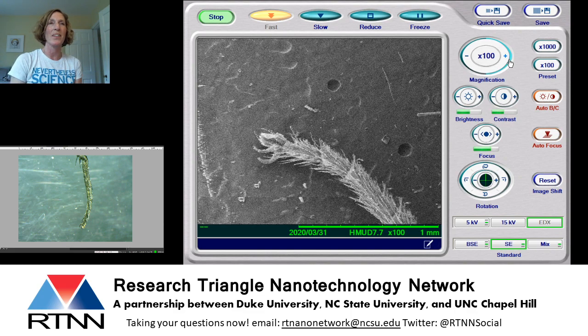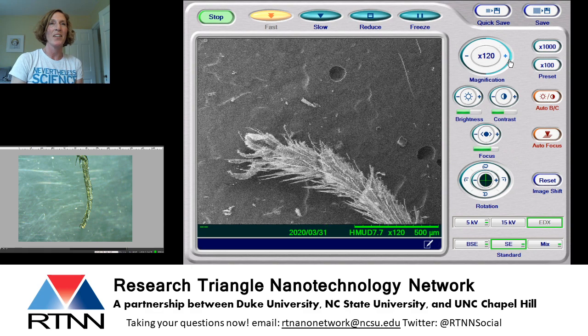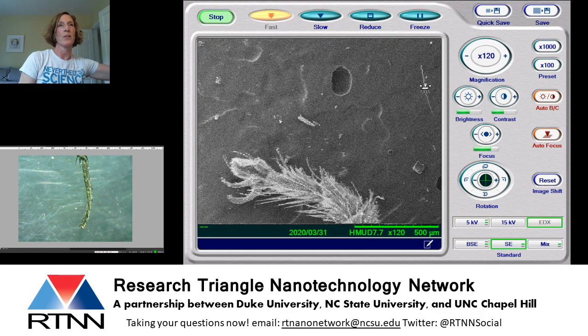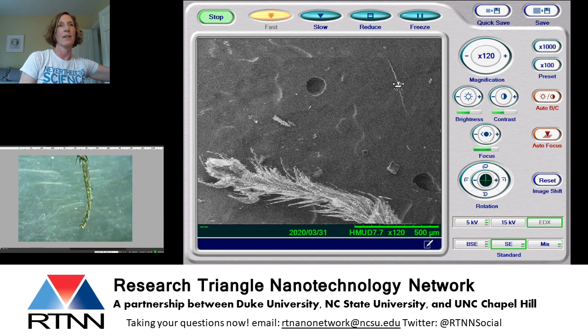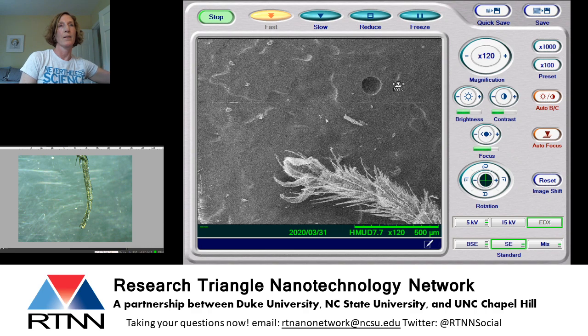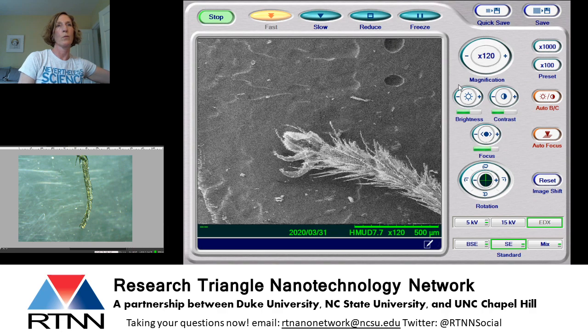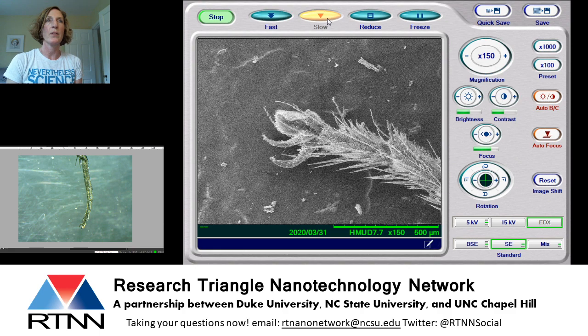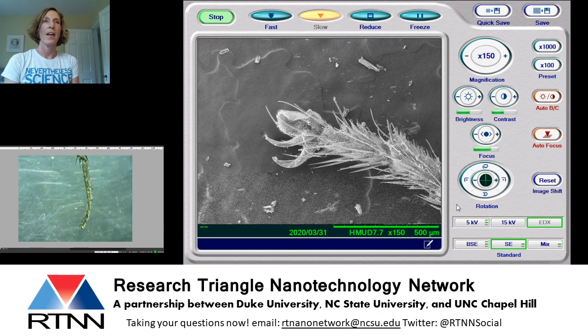We're going to look a little more closely right at the foot of this fly, which I think is super cool. I move that foot right to the middle so I can really zoom in. Okay. Let's do one more click there, and let me slow this down so you guys can see the really great detail of this guy. All right. This fly foot is beautiful, I think. So you've got these little hairs, you've got these big spiky hairs, you've got these awesome little claws here.